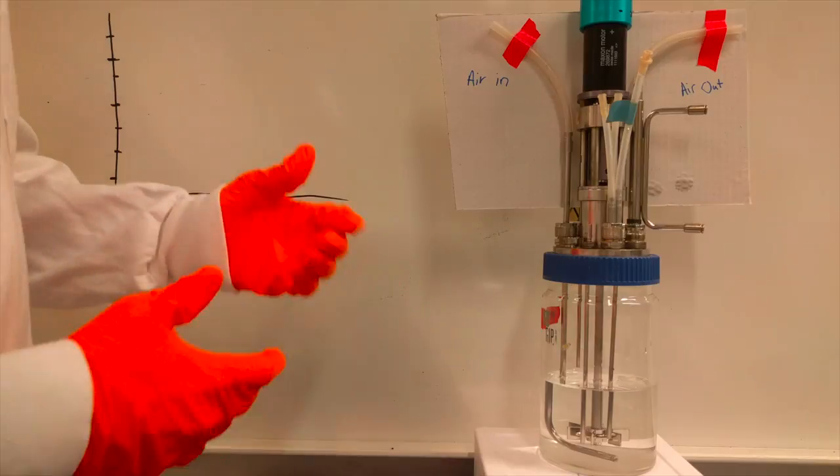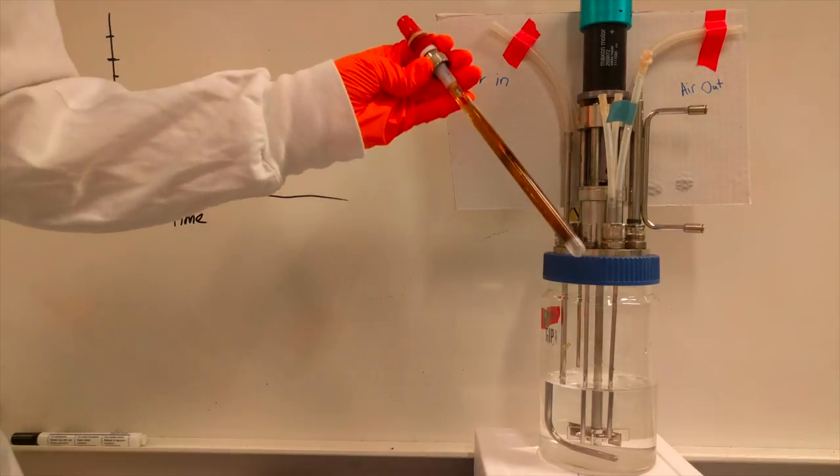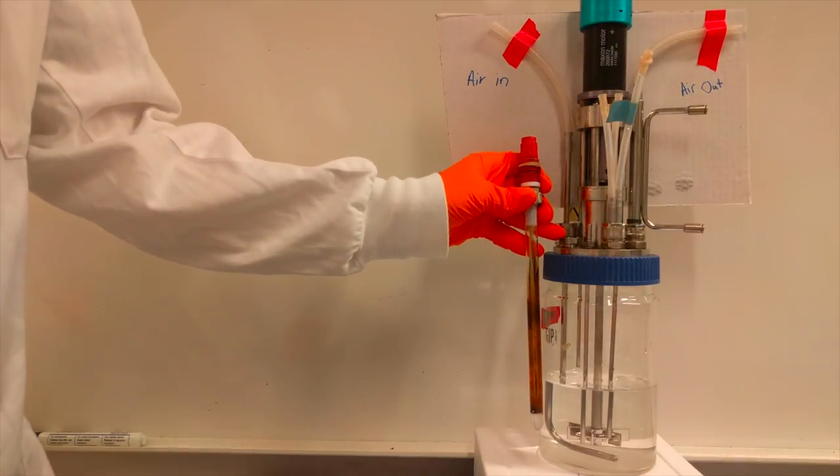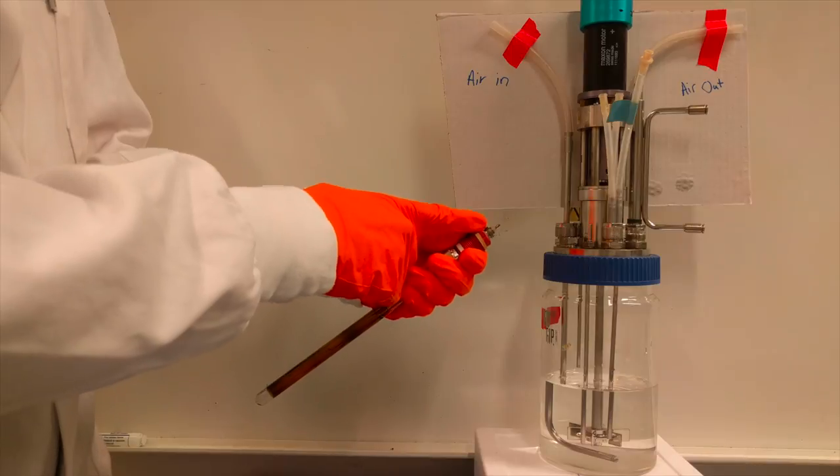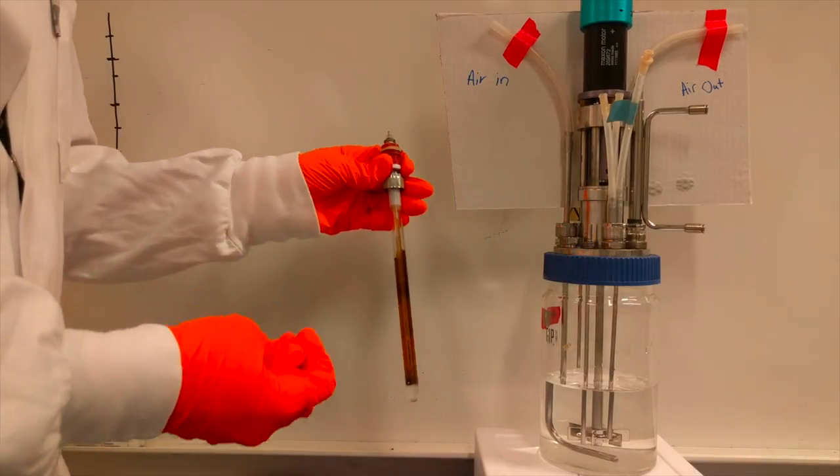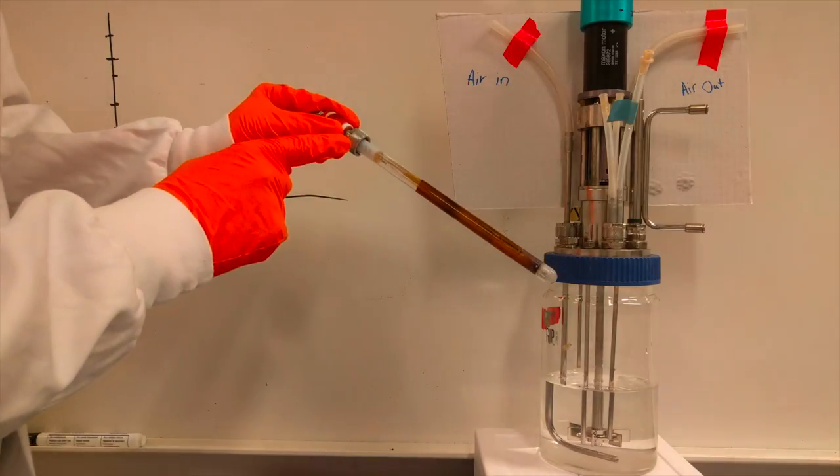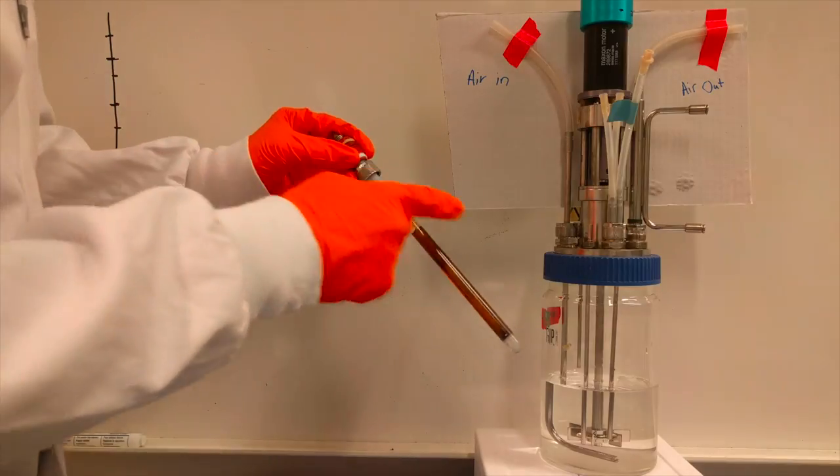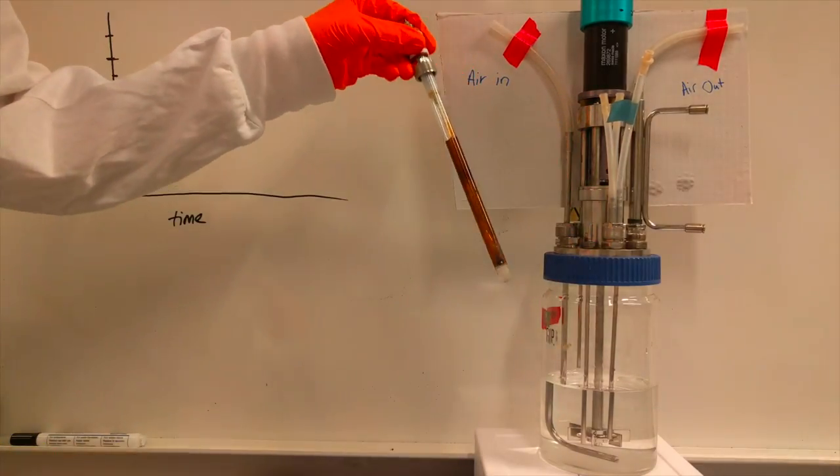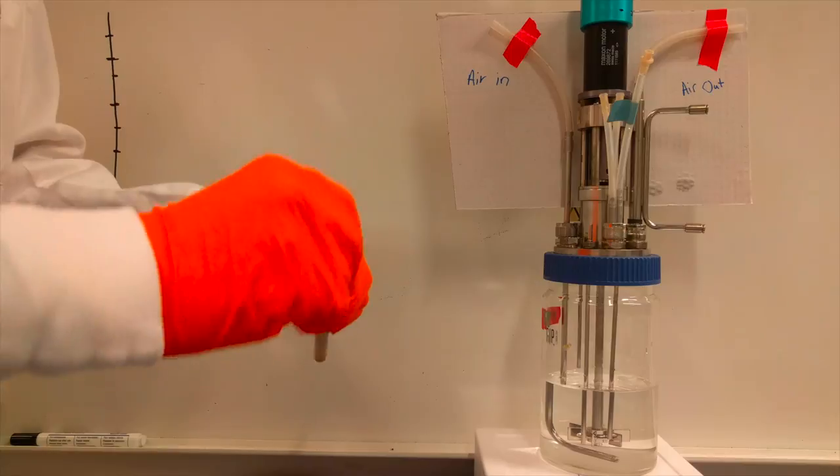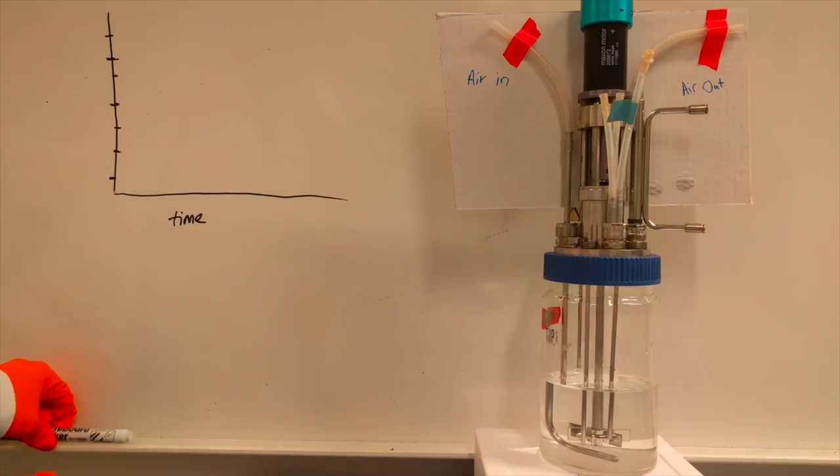Now, being able to add acid and base would be pointless if we don't know the actual pH of our media. So what we have is a probe that is going to measure the pH of this media. This probe is going to sit below the surface of the water inside of this vessel. It's going to be connected on top to a cable, which is going to go to a machine and then to a computer, which will allow us to track in real time the pH of this vessel. That up-to-the-moment tracking, along with our ability to add acid and base, allows a computer on its own to keep the pH of this vessel at a very constant pH.